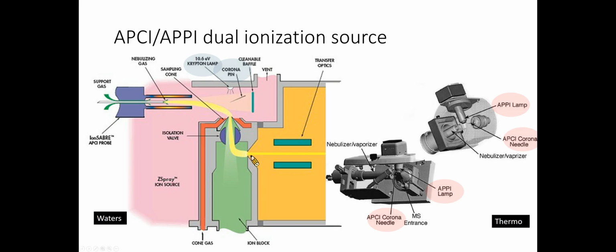As the principles are similar between APCI and APPI, a dual ionization source has been developed by many companies. The users can switch the ionization mode using the same instrumentation these days.